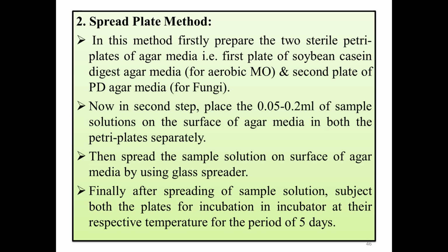These drops of the sample will be placed on the surface of agar media. Separately means we have to place this solution separately on both the petri plates. Then we'll spread this solution. We'll spread the sample solution on the surface of agar media by using a glass spreader.